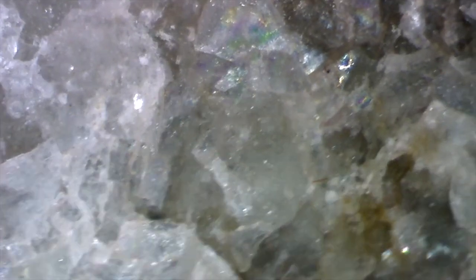So when we look at the rock first, this was the sort of the browny edge that I showed you first. So you can see sort of sandstone in colour, and there's some features there. The microscope picks those up quite well. And then as we move round to that shiny surface, we can now focus in on these little areas of quartz or silica. You can see here the facets of those crystals, and these are now a lot clearer using the microscope. They're really quite amazing structures there.